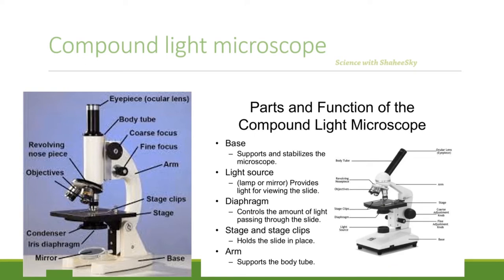Let's move on to what compound light microscopes are. Compound light microscopes are complex devices which are used to observe microorganisms, plant and animal tissues and cells.